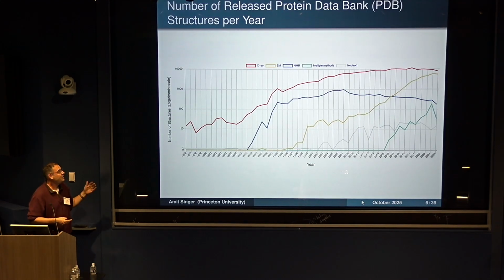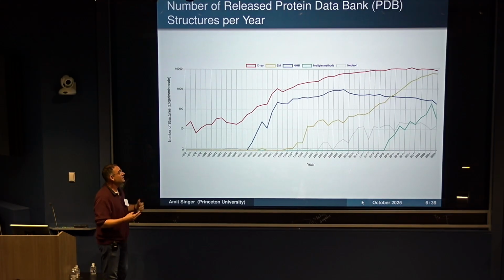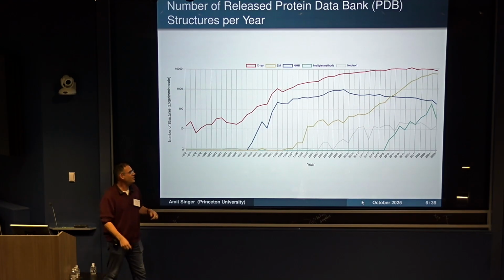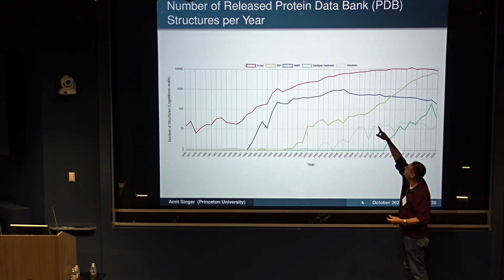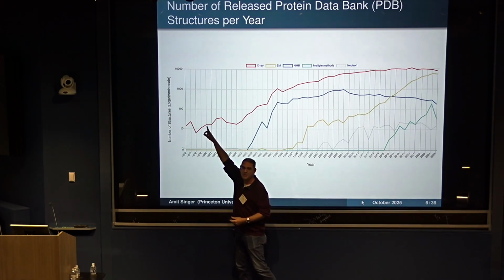And also, if you see just the number of protein structures being determined by cryo-EM, you can see the exponential growth, okay? So this is like 2012, 2013, the resolution revolution. You see the yellow, the number of structures in the PDB, the Protein Data Bank. And I say exponential growth because it's in log scale that you see here, okay?